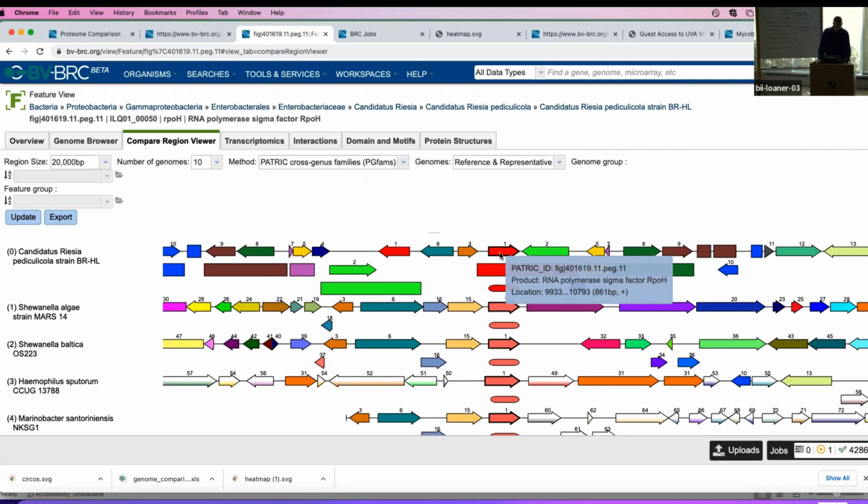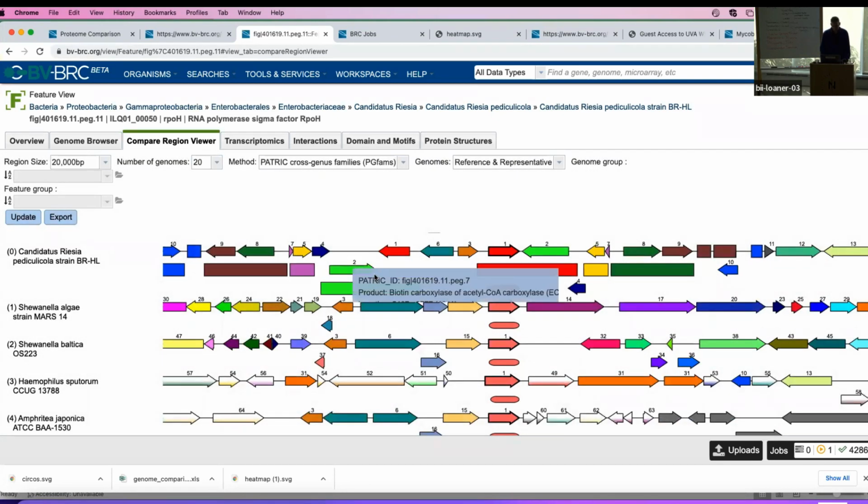So we do a quick estimate of the features in there. We grab a subset. For these very large families, we'll grab a random subset. In one of the upcoming updates, we're going to be keeping a set of representative features for each family that will give us broad coverage over the family. We'll probably be switching to that for this. But for now, we just pick a set of them, and we compute a blast between the focus feature and the set of things we're going to put in the pool, and down select to the top 10 that we want here. And again, I can increase this number if I want to see a larger swath through the space.